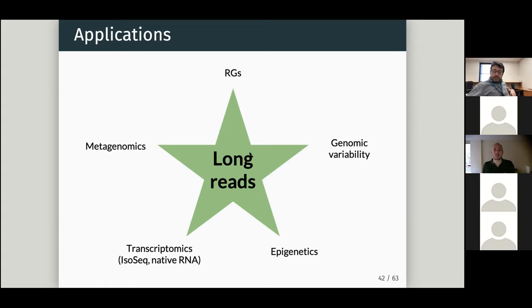One thing about transcriptomics: there are limitations with long reads, essentially due to the throughput. Because you have less throughput with PacBio and Nanopore, you're going to tend to miss more of the lowly expressed genes. But also, there is no method yet to quantify low expression levels using long reads. Again, it's because of not enough throughput.